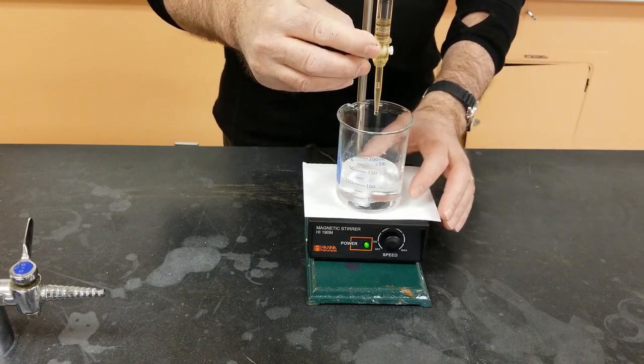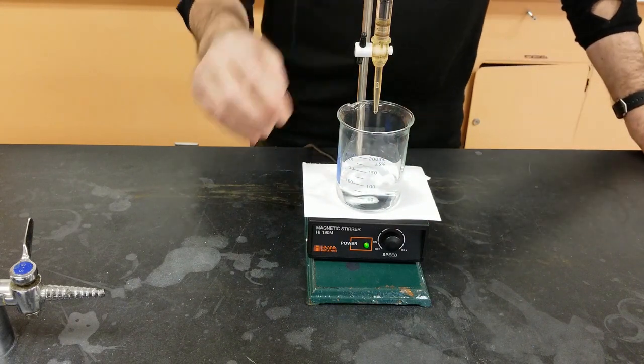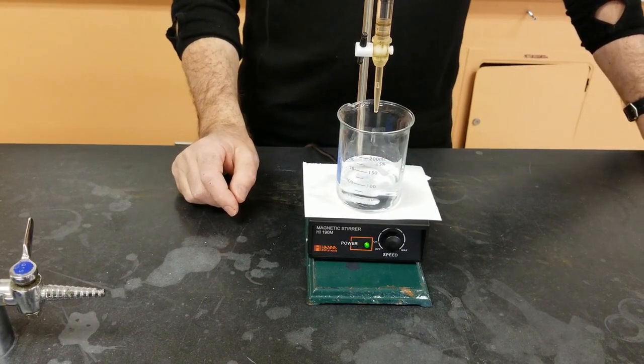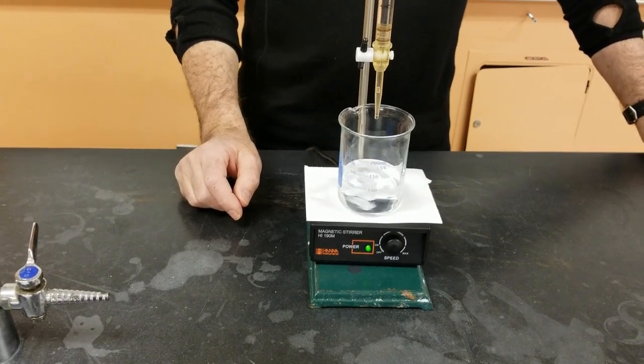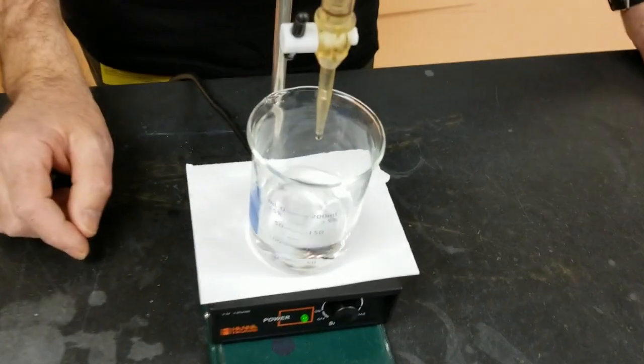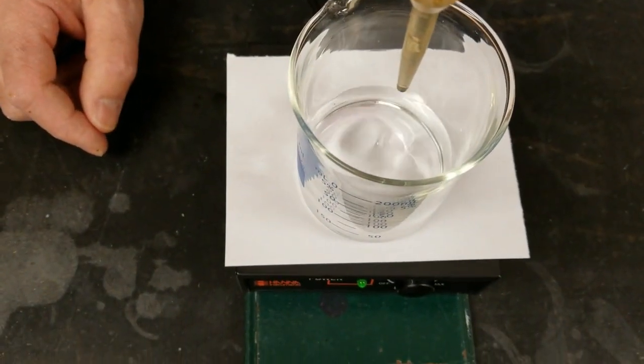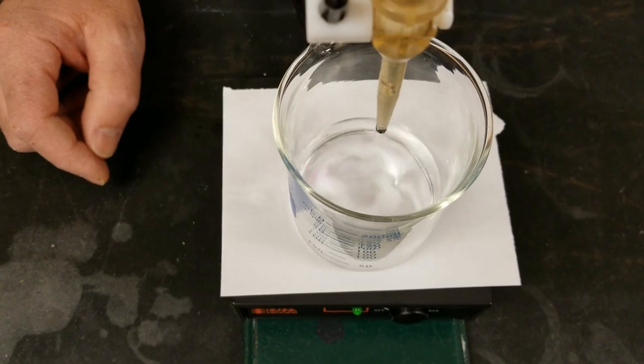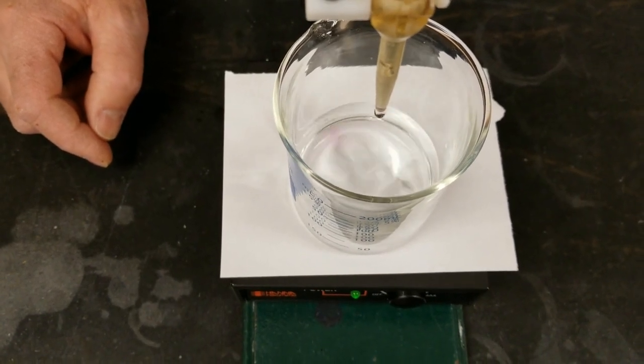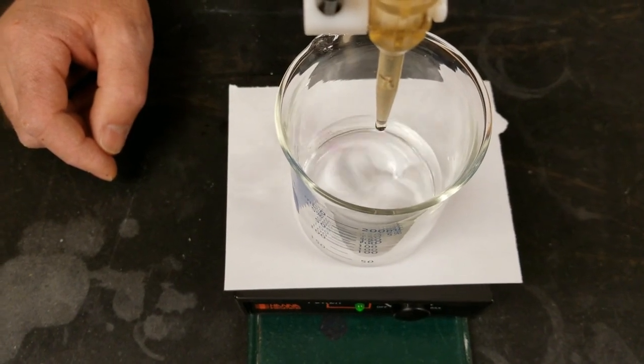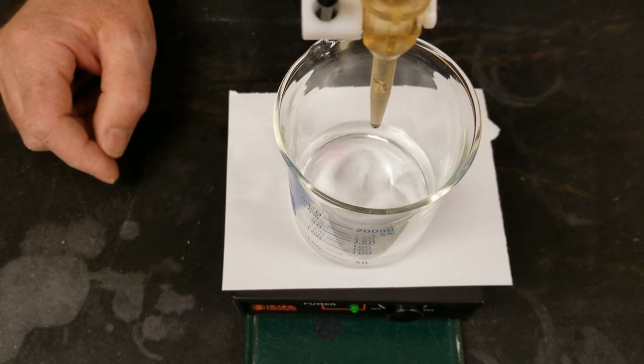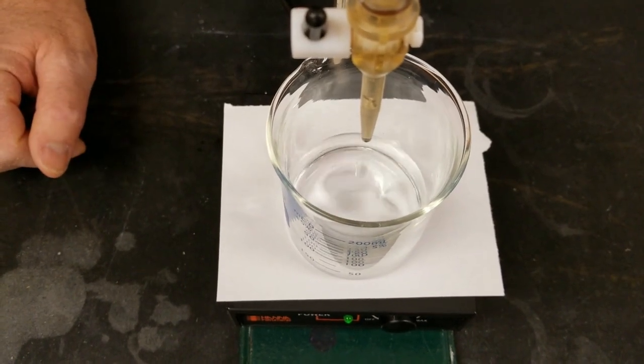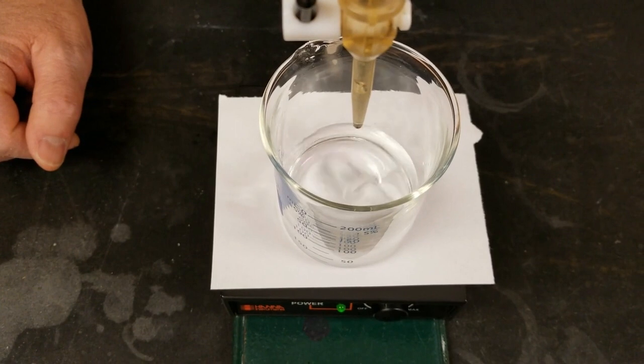And what you'll notice here if you were to get right up over this looking down into the beaker is that where the OH- is dropping into the acid, we're getting little flashes of pink because there's lots of OH- until it disperses. But it disperses very quickly at this point because the amount of OH- is far below the amount of H+ that's available from the KHP.